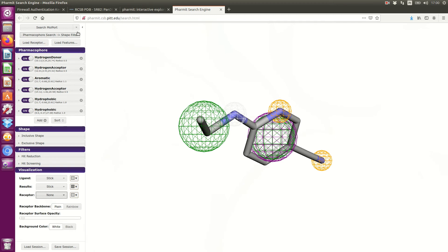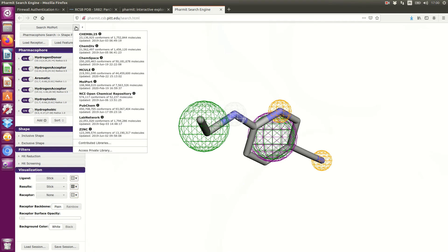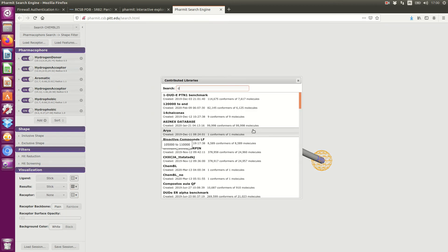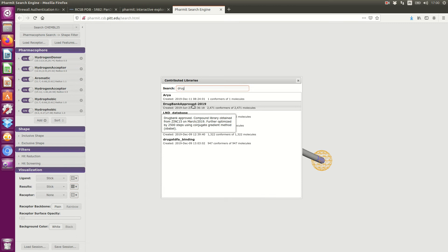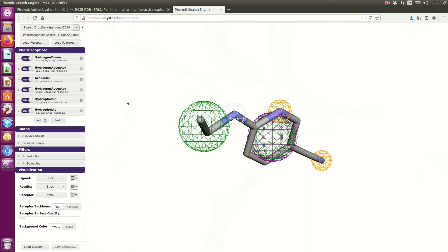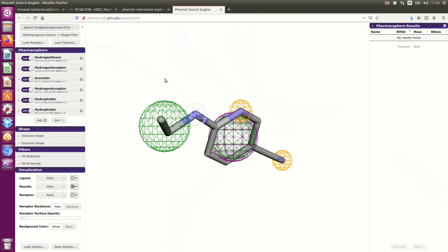I will choose Drug Bank Approved as the chemical collection, because it is smaller, but you can run searches against other chemical collections. Now I make the search. I didn't get any results, but you can start to relax these conditions and try again.